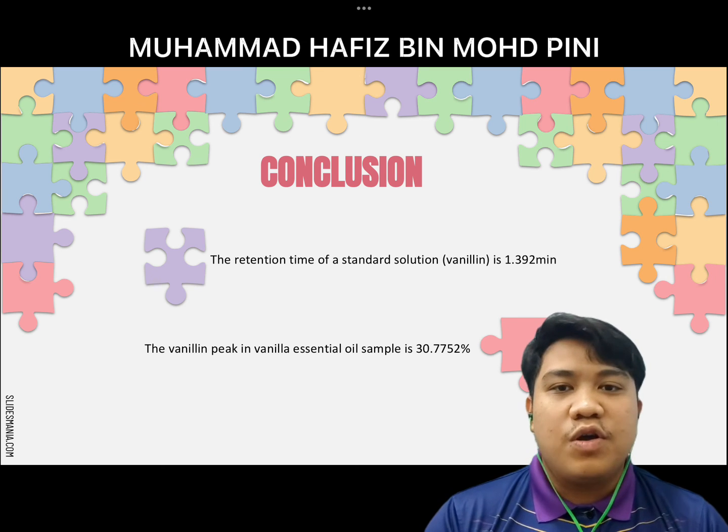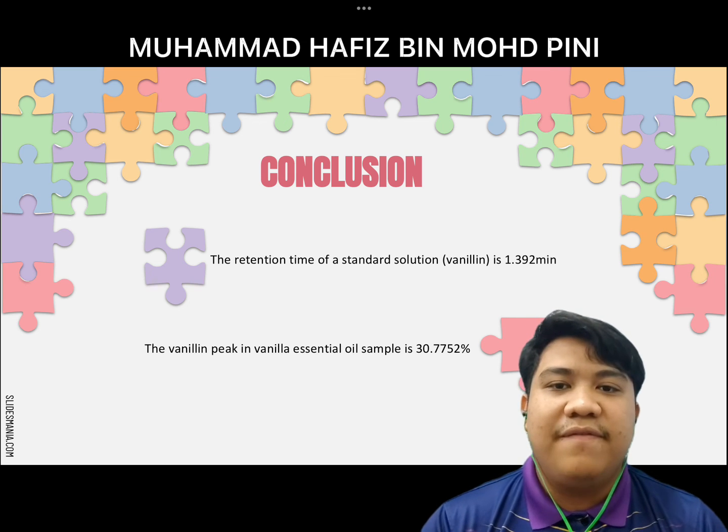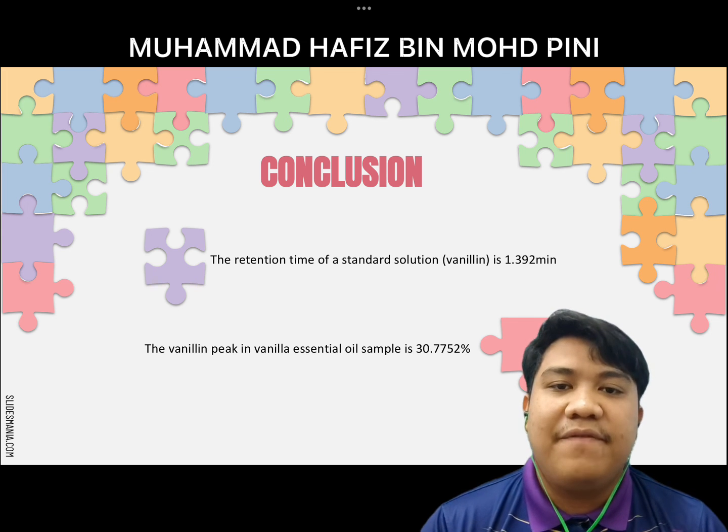In conclusion, the retention time of the standard solution vanillin is 1.392 minutes. Then, the vanillin peak in the vanilla essential oil sample is 30.775%.